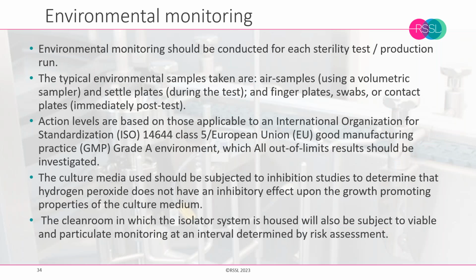Environmental monitoring applies. I'm not going to say too much about this, but under Annex 1, it is no different. Just because there are enhanced protections from an isolator, the level of environmental monitoring needs to be equivalent as we would apply to a RABS or any kind of conventional clean room model. But it is important that we can demonstrate that the mechanism for getting media into the isolator is not going to be adversely affected by the hydrogen peroxide.